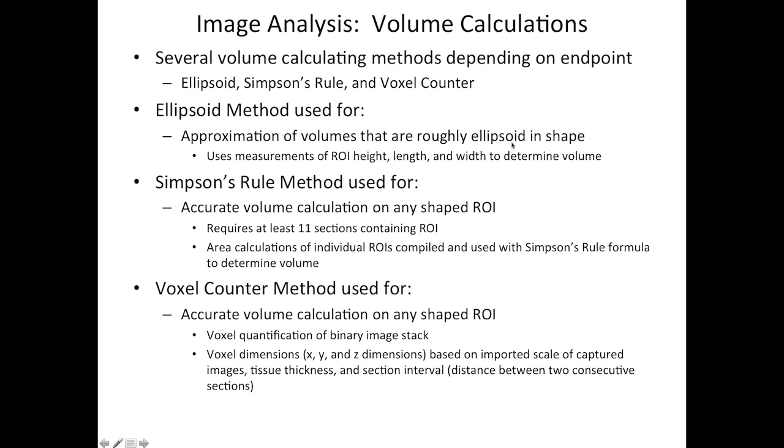So what you would do is measure the area of a given region of interest across several levels, and then you would compile this into the formula, and we have an Excel spreadsheet that we compile everything into, and it does all the calculations, and we get a volume at the end once all of the area measurements are input.